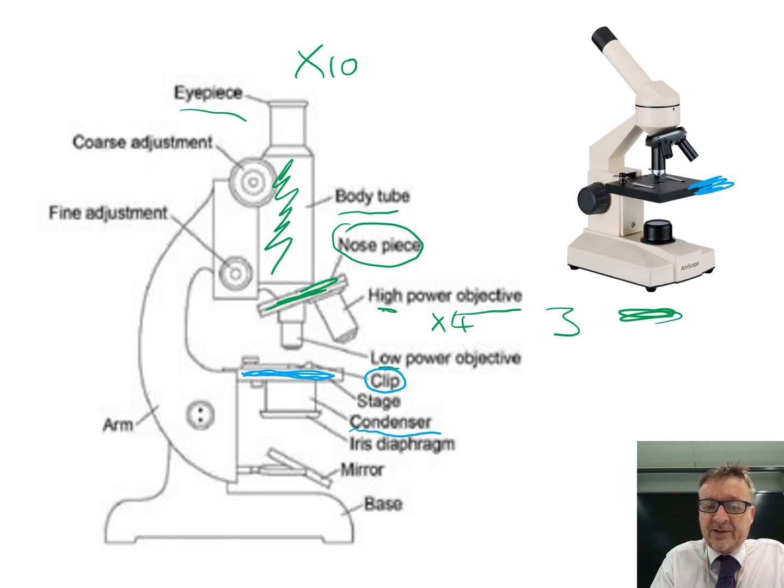Underneath the stage you've got a condenser and an iris diaphragm. You can twist it around, and what it does is make the hole bigger and smaller to let different amounts of light through.